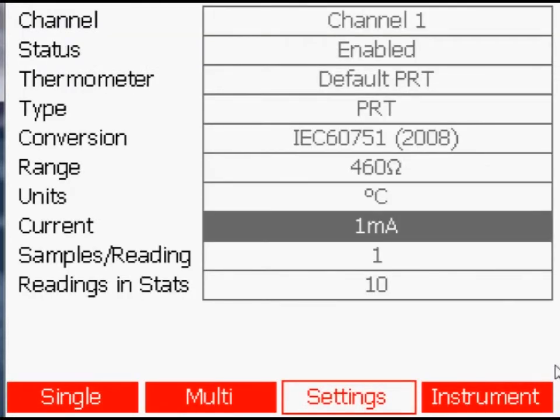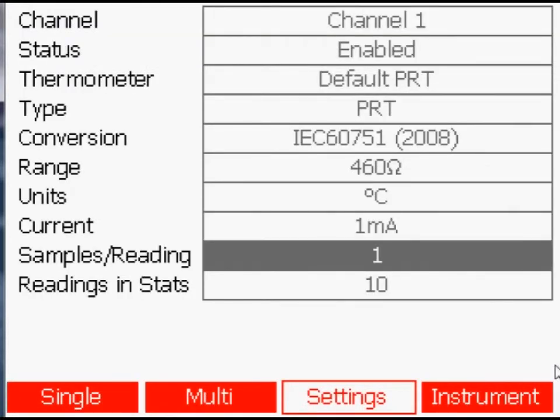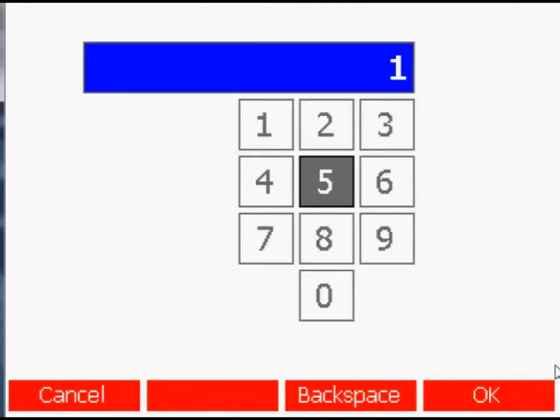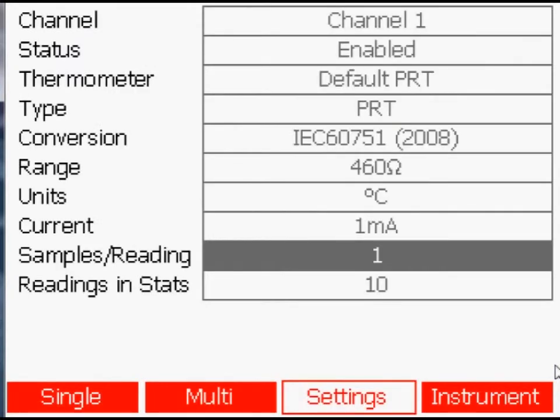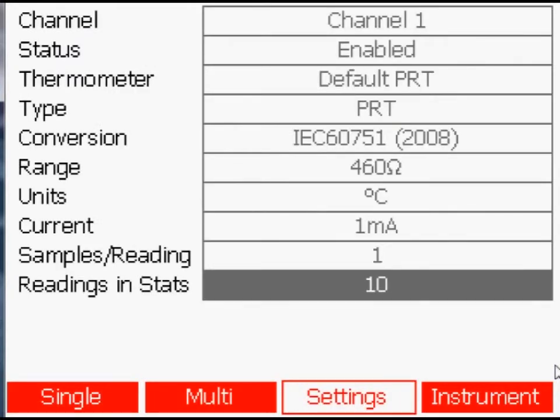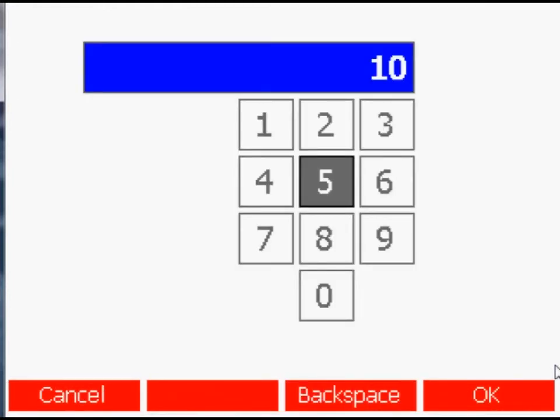Press the Enter key when Sample/Reading or Reading and Stats are selected. This opens a numeric entry window. This may be quicker than using the left and right arrow keys to change the value.